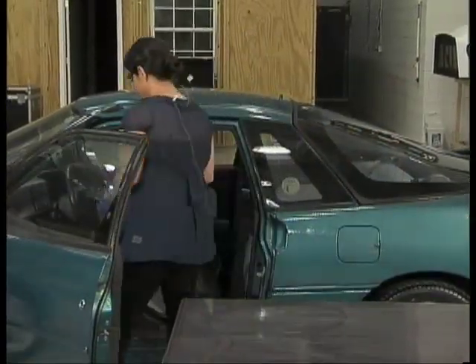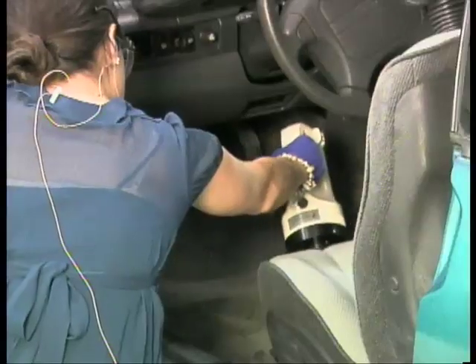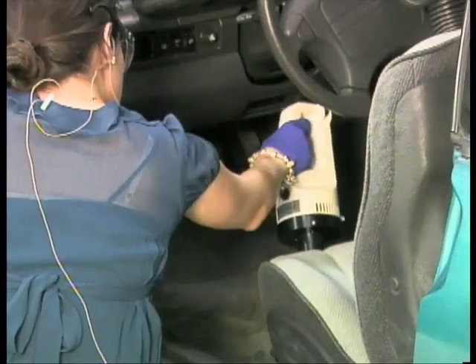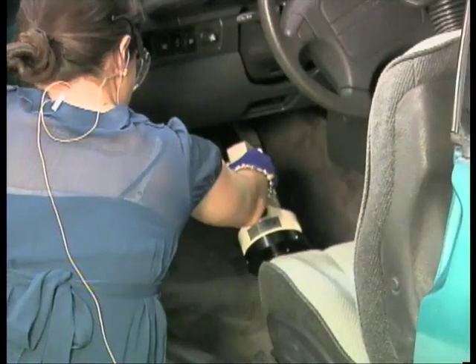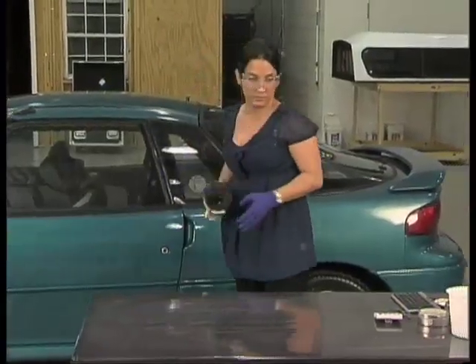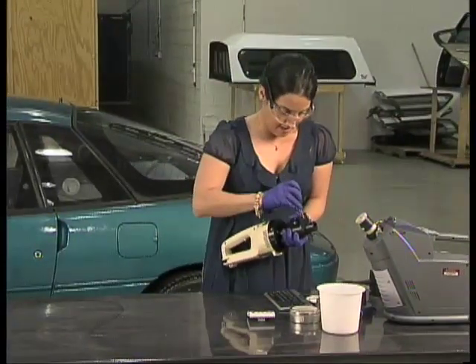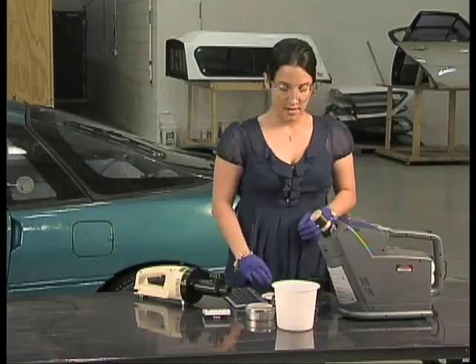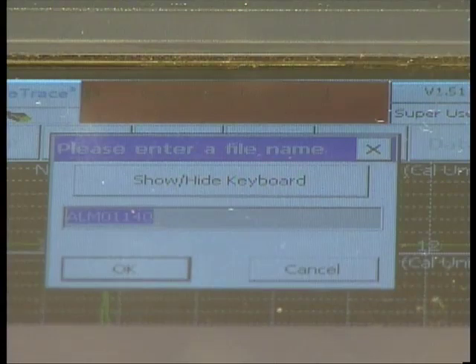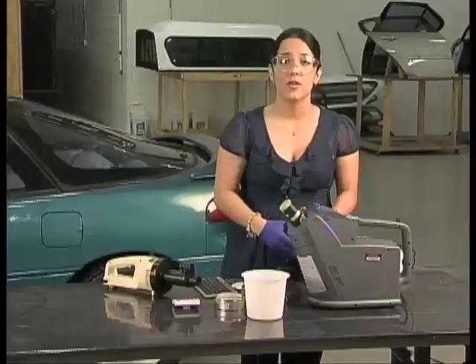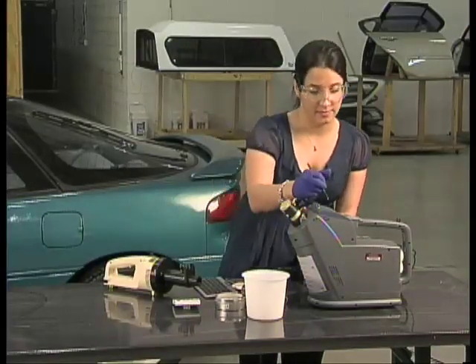Opening the car door, we sample our hide, which is located under the driver's seat. We have now sampled for 30 seconds. Introducing the device into the ion mobility spectrometer and pressing trigger — explosives were detected from our hide, from the air surrounding it. Bear in mind this is a small amount of smokeless powder contained within an electrical box sealed inside a plastic bag, and the compound detected was DNT as an indicator of smokeless powder.